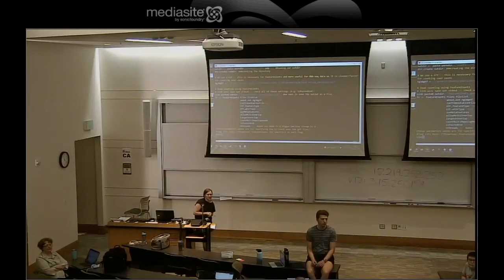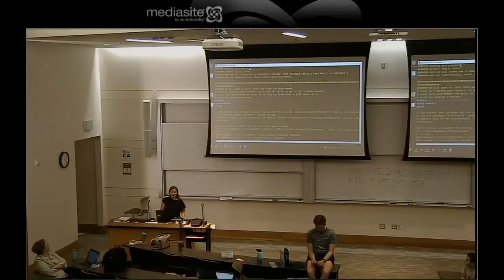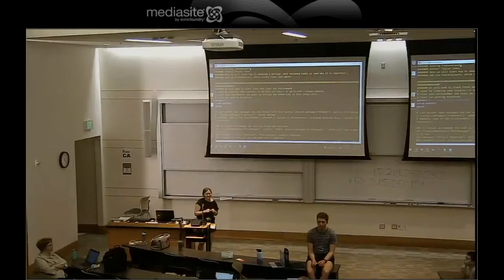So this is actually just like the script that you guys are working on. So you don't actually have to tell it you're working in R. What we'll do is we'll call R through our sbatch script. Yeah, that's a great question. I think it was actually a little confusing. You cannot run this particular R script with sbatch. You need 2 scripts in order to run this. Because what you're going to do is run an sbatch script that runs R that runs this script. Sorry, that was confusing.